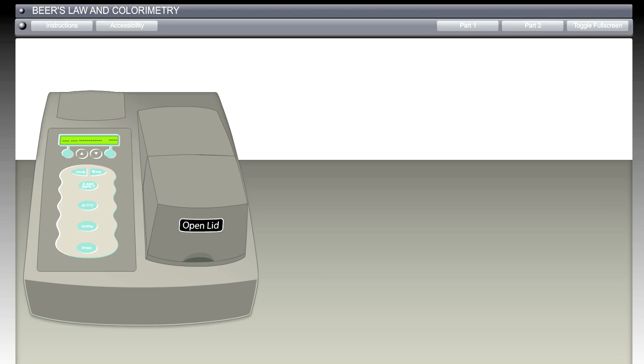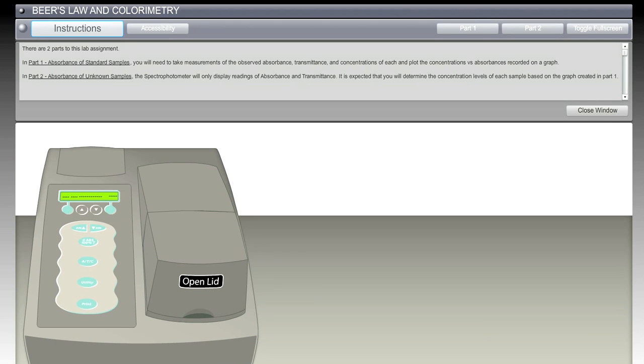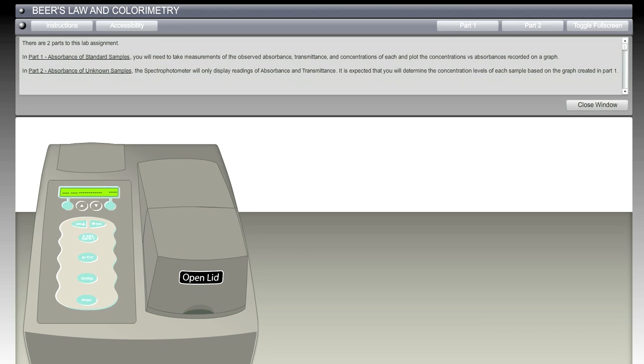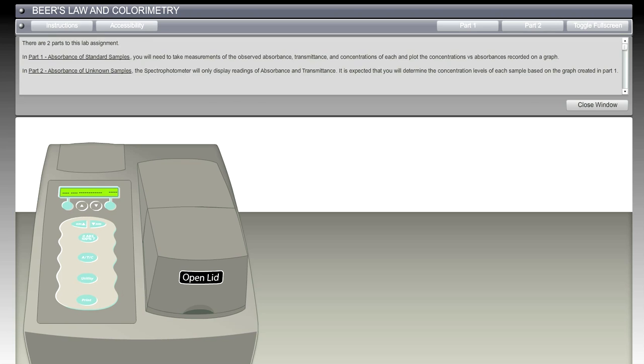So let's jump right into it. For the instructions, we made it very simple. We're going to have two parts. Here we have the absorbance of standard samples. We're going to take measurements of the observed absorbance, transmittance, and concentrations of each and plot these concentrations versus absorbance and record them on a graph. This is a bit of a hybrid approach to doing online versus in class.